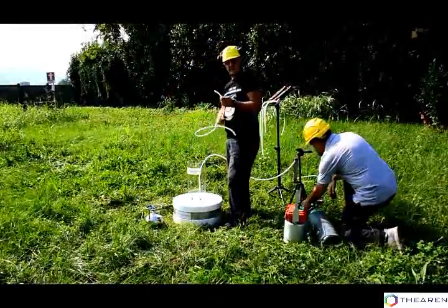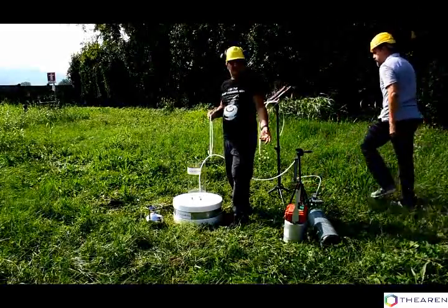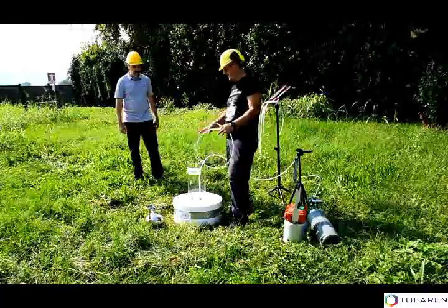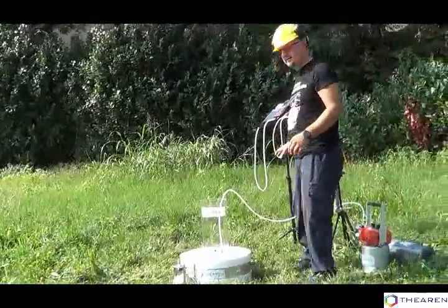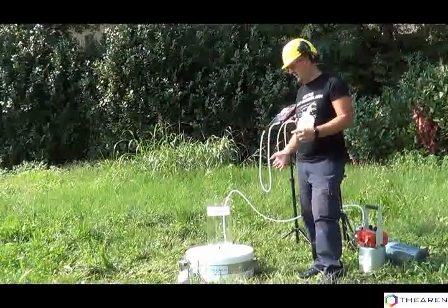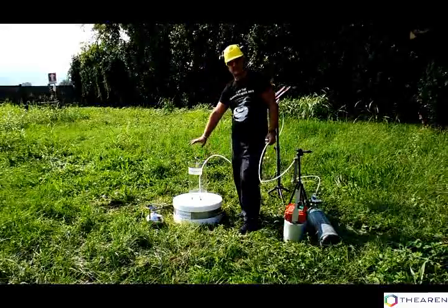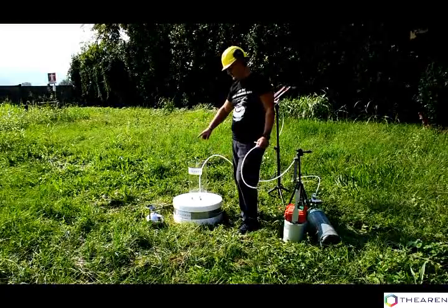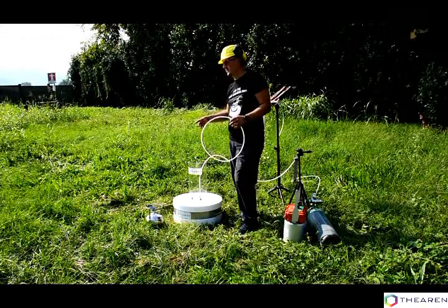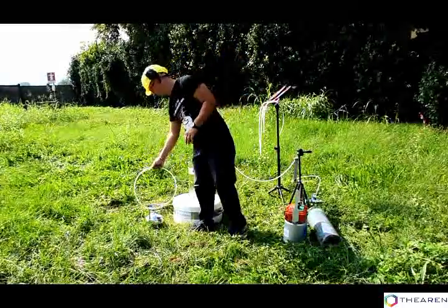In a dynamic flux chamber, a carrier gas, normally high purity nitrogen, is injected in a controlled flow inside the chamber by means of connecting lines with a particular spiral geometry. The gas, in contact with the soil, enriches itself with the volatile compounds in emission from the surface and goes out by the vent holes. VOC are collected and determined in the output stream by specific sampling and analysis methods. Before starting sampling, it's necessary to purge the system, replacing all the air present initially inside the chamber with the gas carrier.